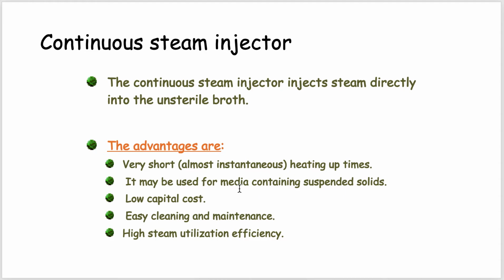But if we use a continuous steam injector, there is no chance of such an event. Then capital cost is low, cleaning and maintenance is easy, and there is high steam utilization efficiency. We can use steam very efficiently; steam will not lose any heat to the environment. Rather, all the heat absorbed by the steam will be utilized for sterilization.